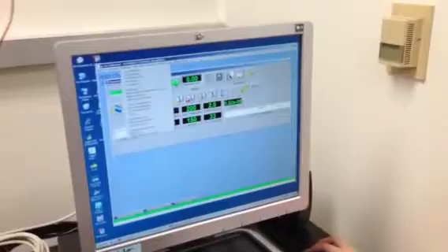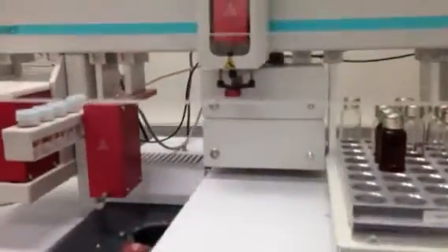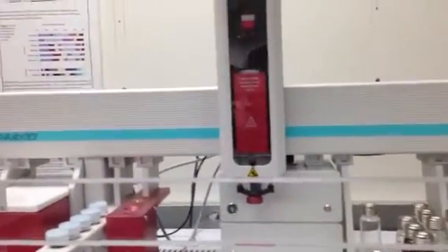From here you go to Sequence, Run Sequence, and make sure everything looks good — that it's saved under the right folder, and if not you can change it. Otherwise select full method and inject anyways, then say Run Sequence. The instrument will make a noise and the needle will start to move.